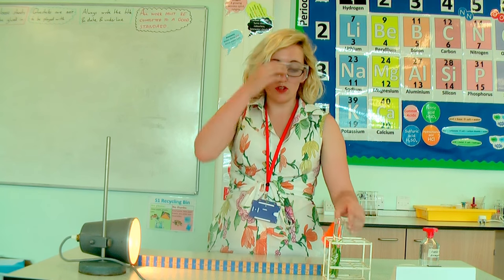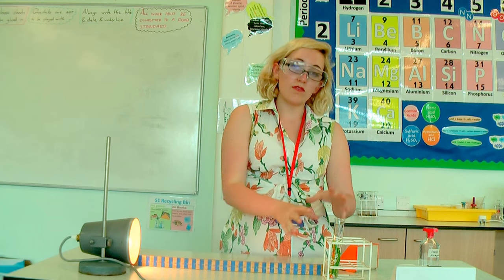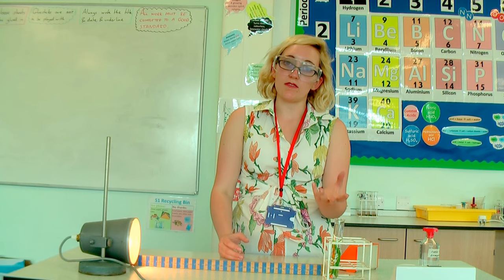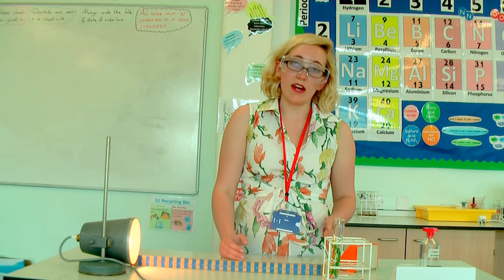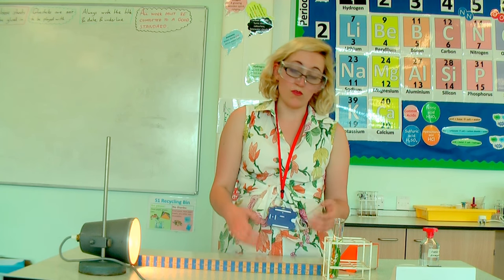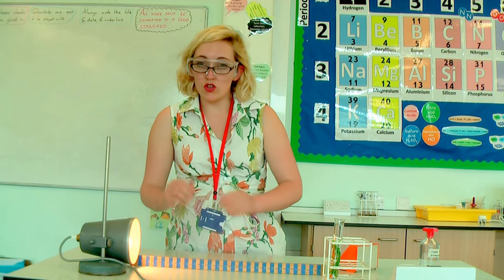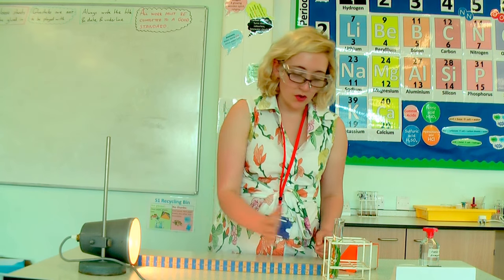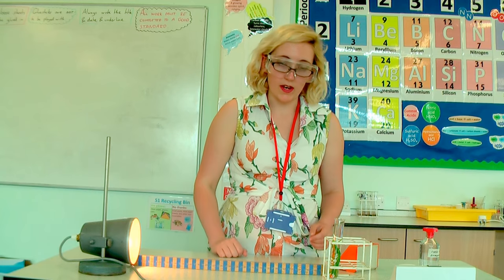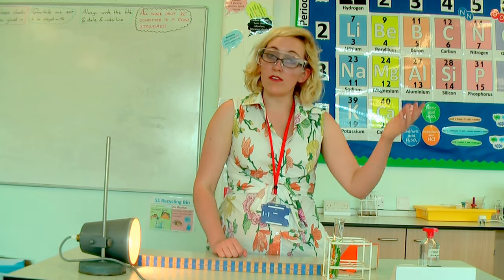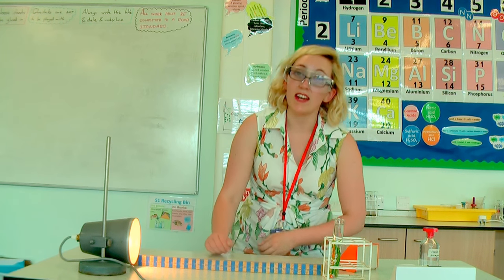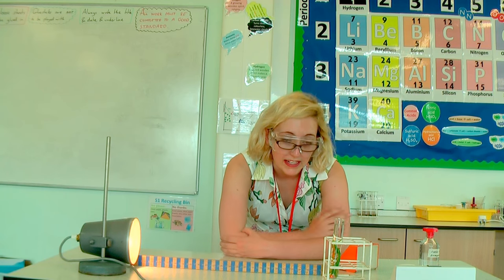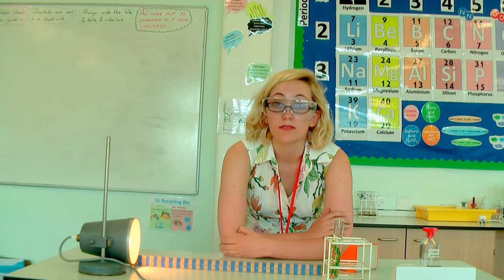I've also got myself a stopwatch. Once you've let the pondweed acclimatise for about a minute or so in the boiling tube, you're ready to start the experiment. Switch on your lamp, note the distance away, and all you have to do is stare at this little boiling tube for one minute and count the number of bubbles that come off.